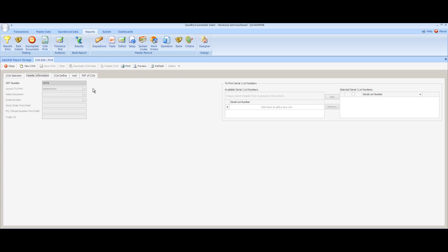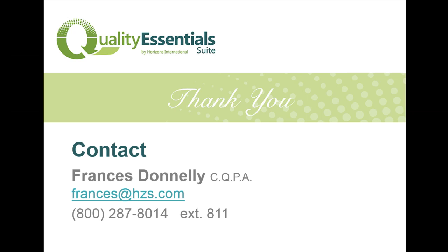There's lots of other functionality related to the C of A that we could go through, including things like user defined fields. Here we have a trailer ID. There are up to six of these fields that can be added to the header of any of the reports. We hope that you found this information interesting. And we look forward to an opportunity to discuss the details with you in person. Please don't hesitate to call us or send us an email if you'd like some additional details.